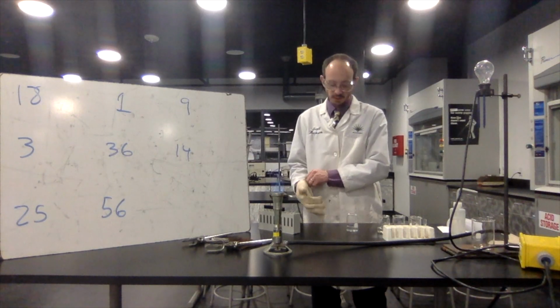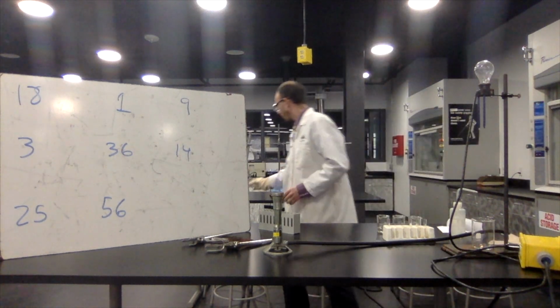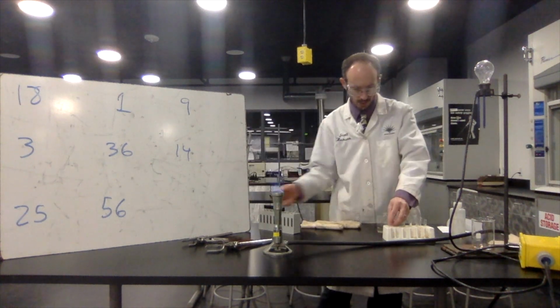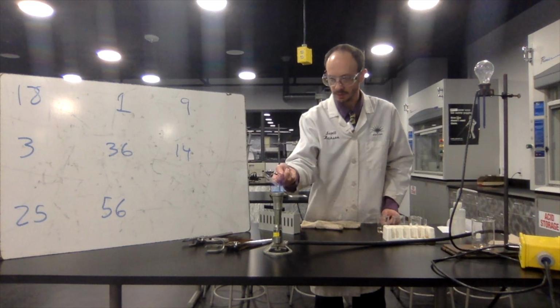So there was no conductivity the first time. Here's the second trial. Now we're seeing conductivity. I can put this over to here. Grab this with my tweezers and test for melting.